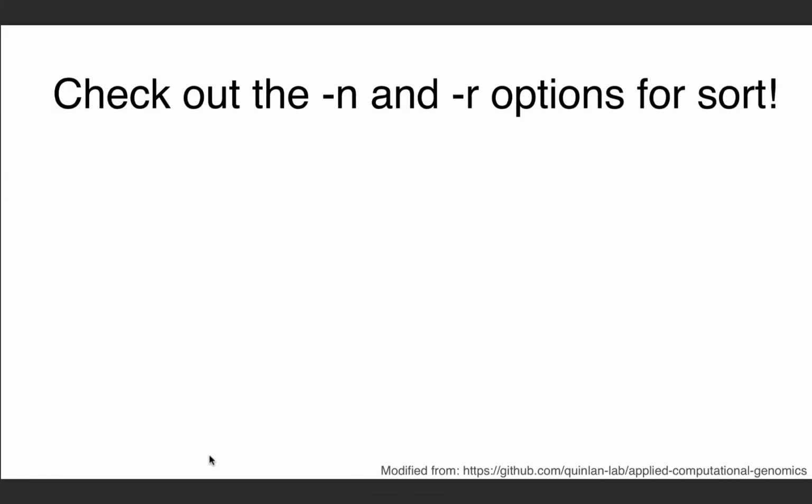Other things that you should think about when you're sorting, you can get very creative about numerical and reverse sort, as we played around with a little bit during the BLAST lab. But this is all just to illustrate how powerful Shell can be for manipulating and exploring large data sets. Really, the more little tricks like this that you start to get under your belt, the more you can do, and the more you'll only really be limited by the types of questions you think to ask with the data.